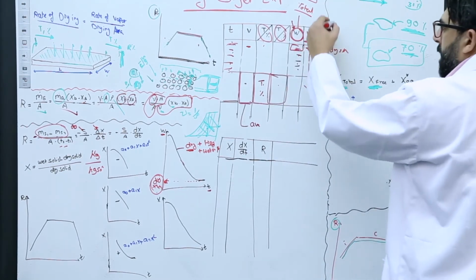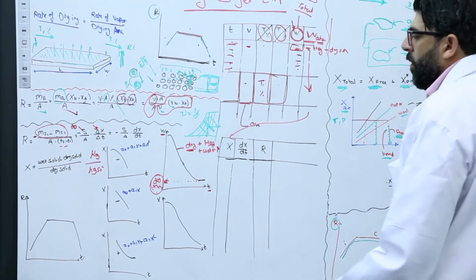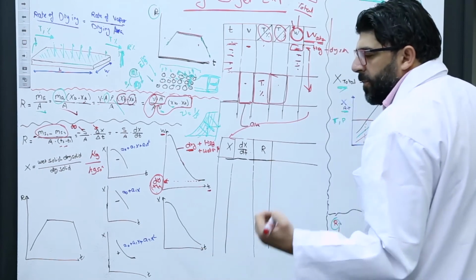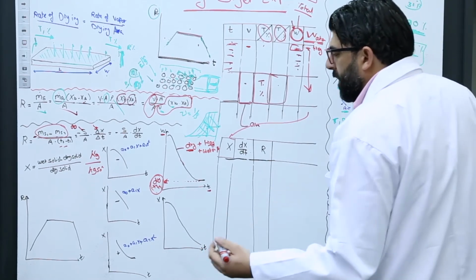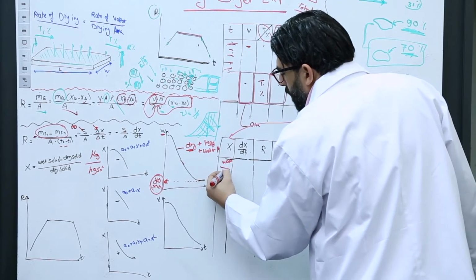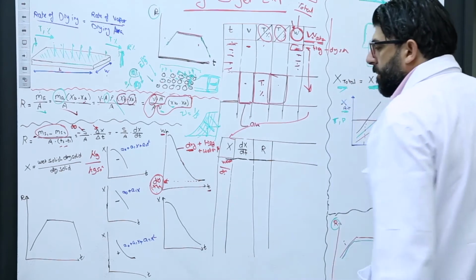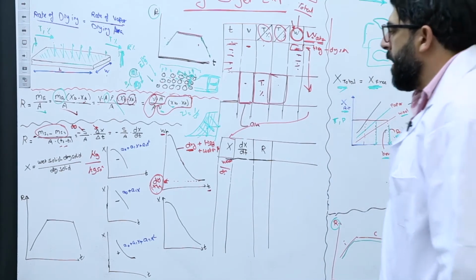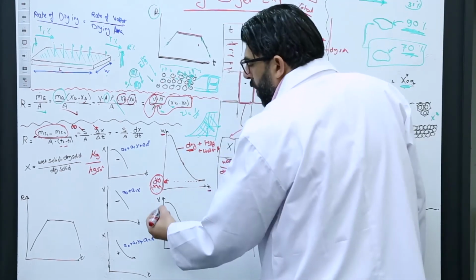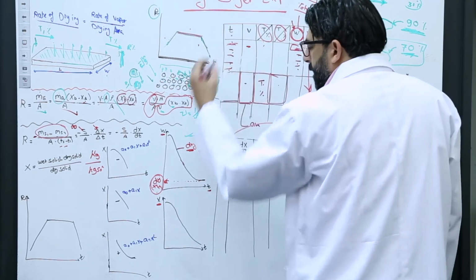Then create another column. We'll go down here. This column is X, and X represents the humidity of the solid. So it will be water over dry solid. Water is the previous column, and dry solid. Okay. Then you can plot X, this column, against time again.